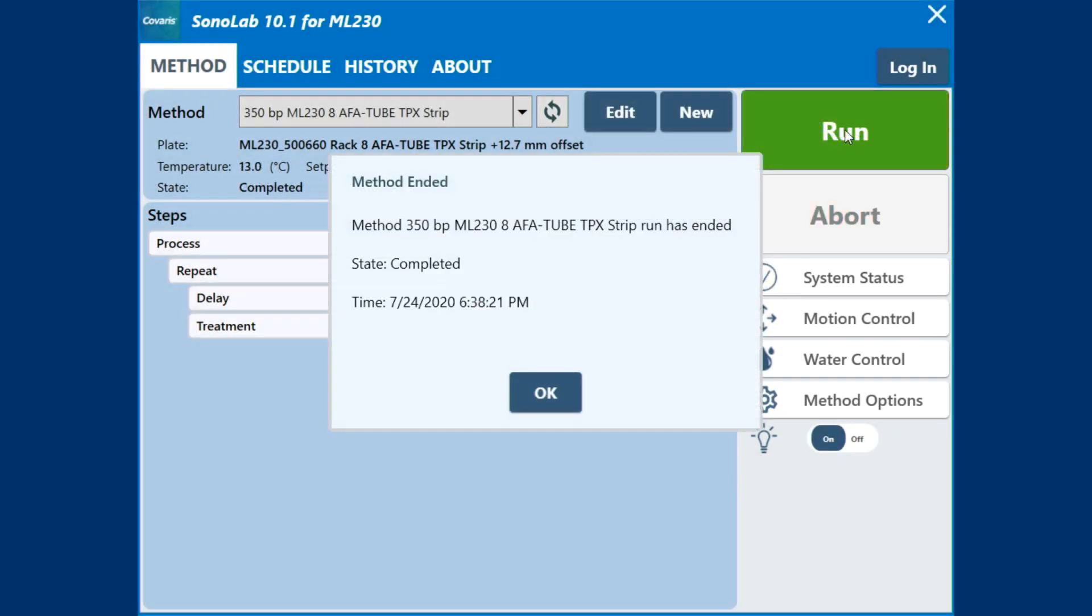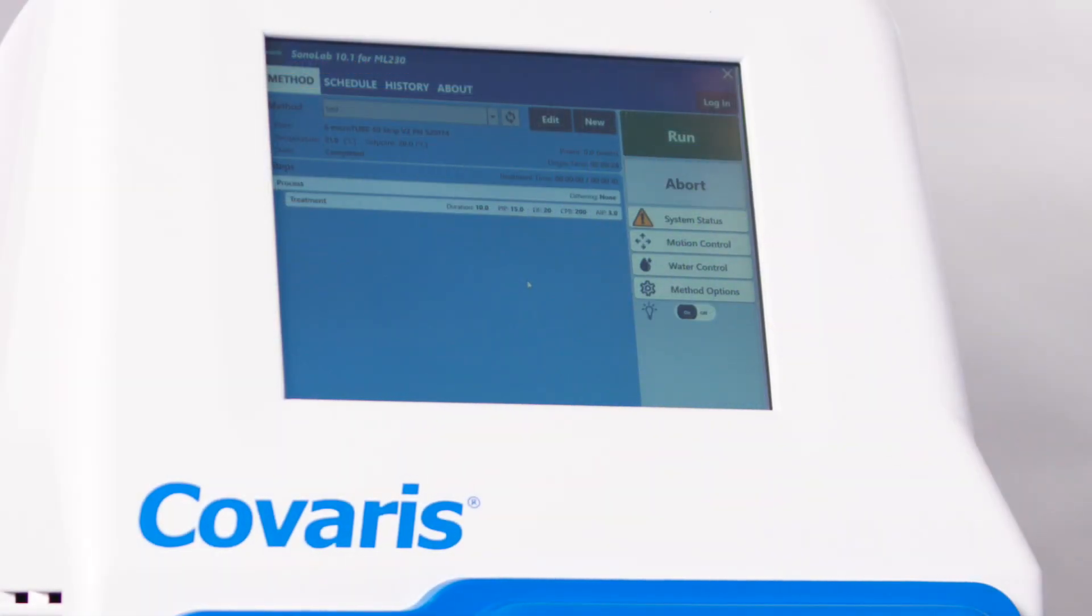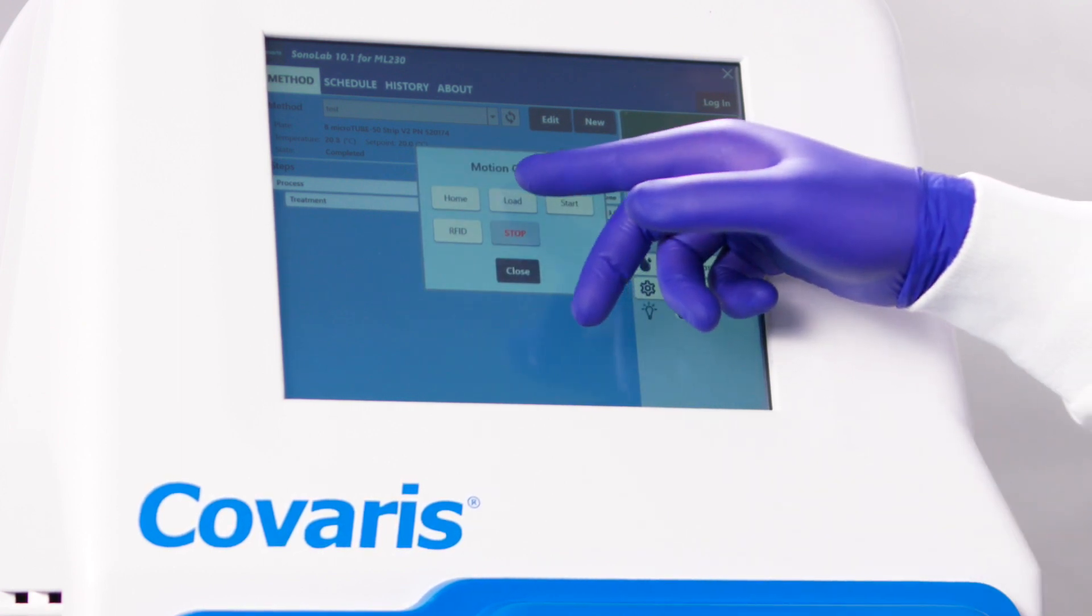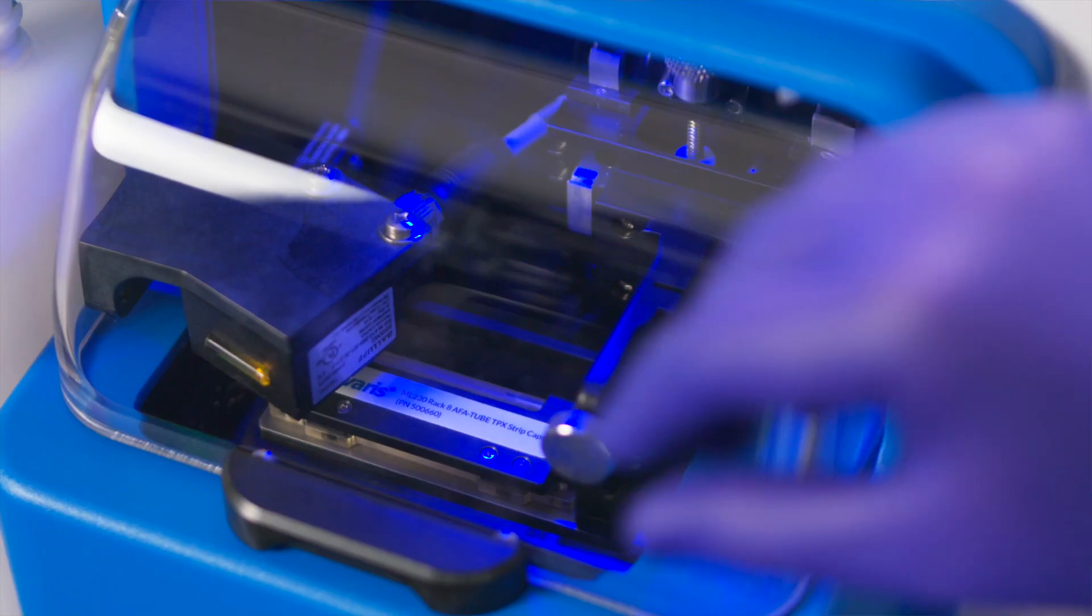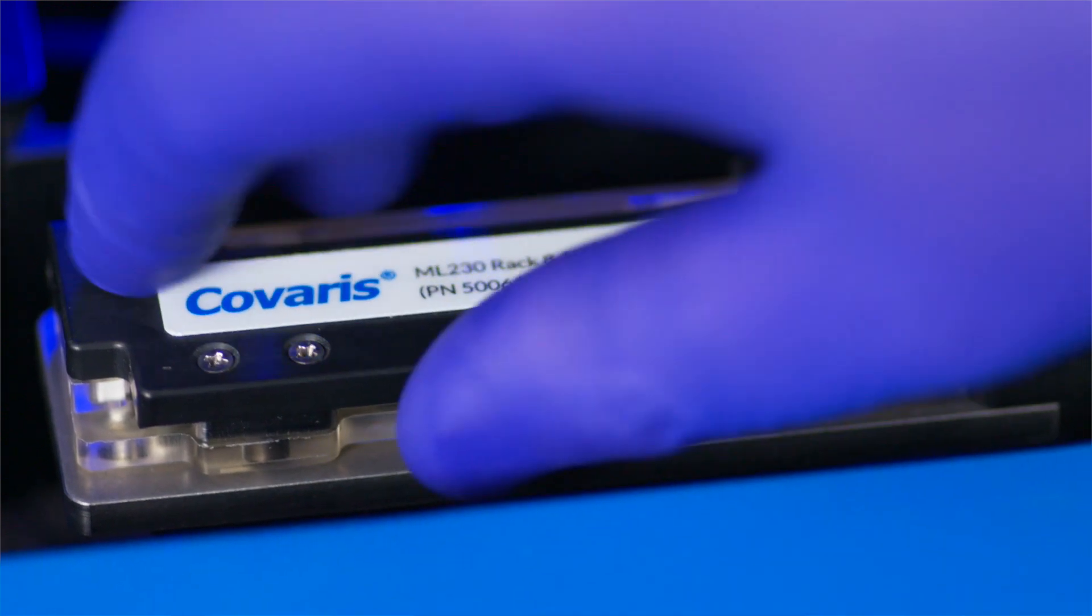When the method has finished, the message Method Ended is displayed. Touch OK, then touch the Motion Control button, followed by the Load button from the Motion menu to raise the sample tray out of the water bath. When the sample tray stops moving, raise the safety cover and remove the treated sample rack.